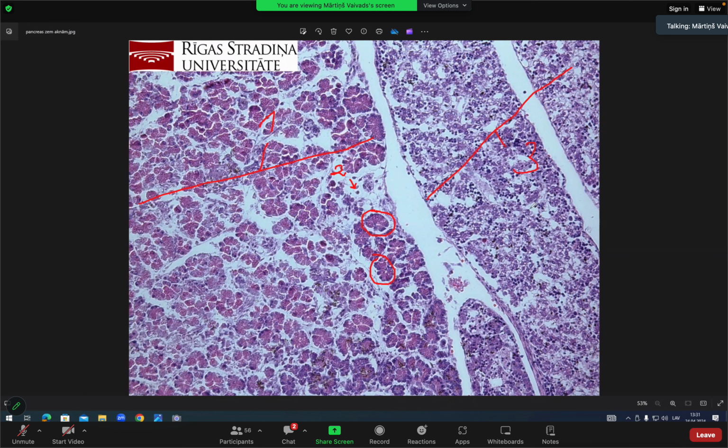And if you zoom in this liver, again, all three liver cell types can be asked here. If you see them, of course. Hepatocytes, megakaryocytes, not in this slide maybe, but hematopoietic islands stand out. But that's the idea here. That's in the rats. So this is rat embryo. This is still pancreas development.